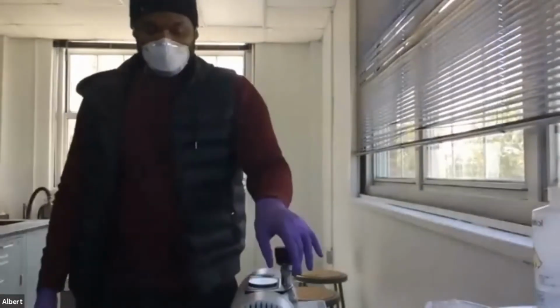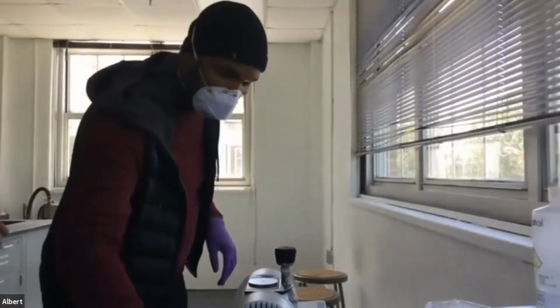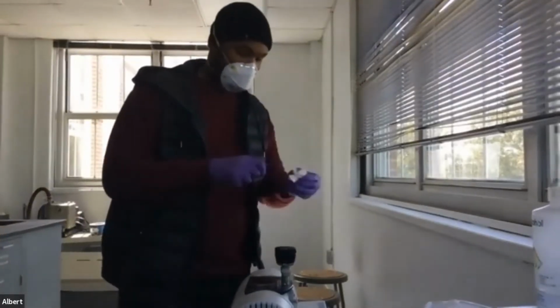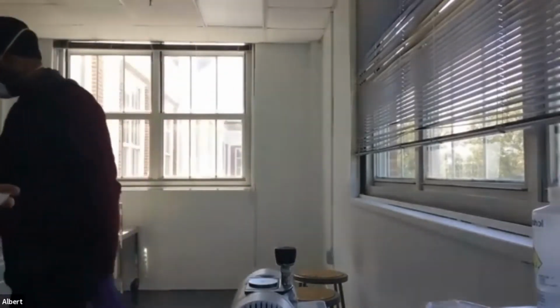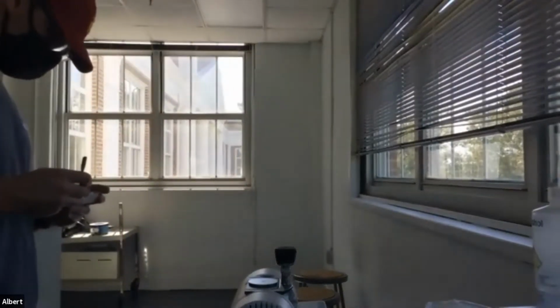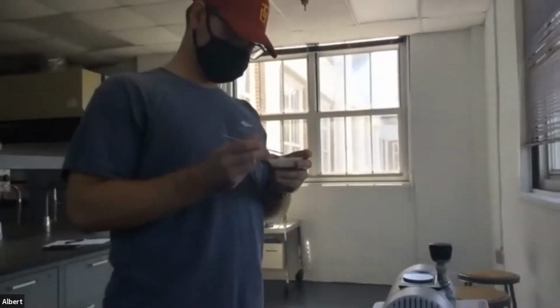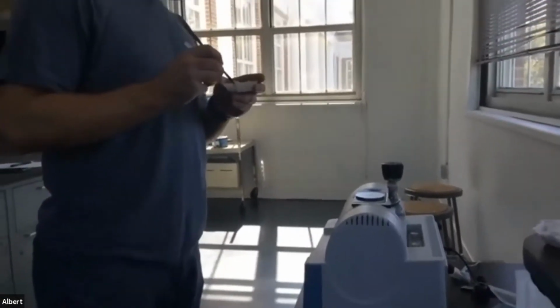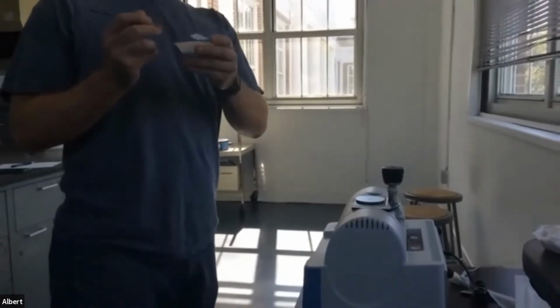All right. So let's run another sample. I'm going to let Eli run the other sample that's up there. So same thing, take the spatula, clean that off. Take the spatula, add some directly to that diamond on the plate. Just enough right there. Oh, it's actually too much. Like that. Yes.